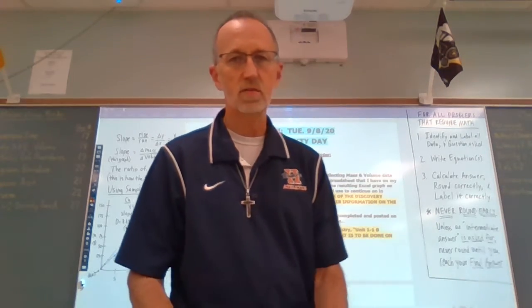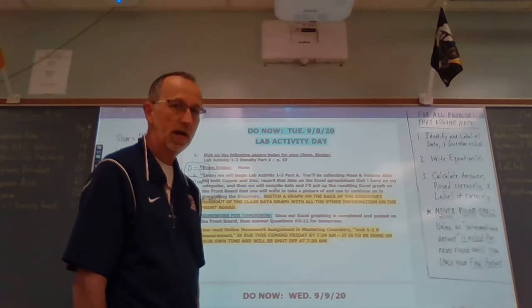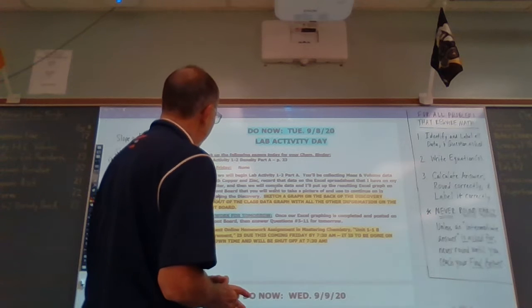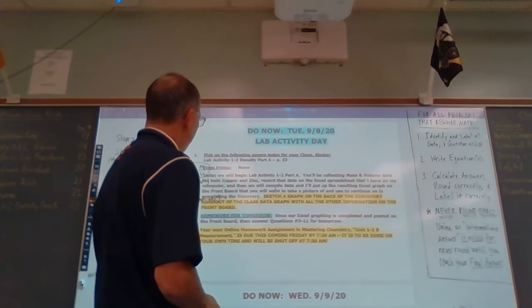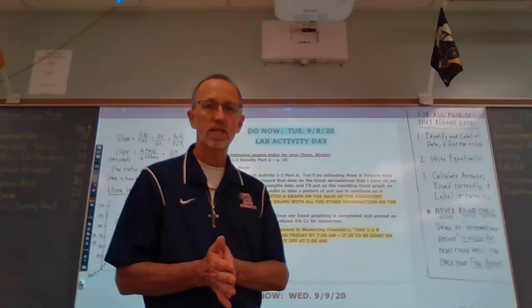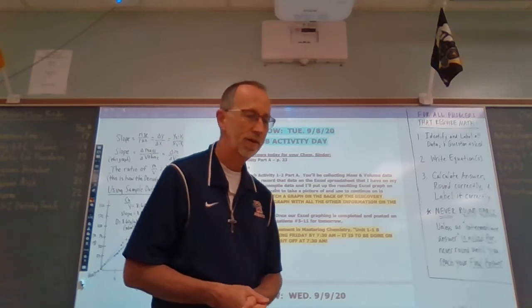So let's look at today's do nows, our schedule for today. Today we're going to start, at least collect the data for and get rolling on lab activity 1-2, part A, which involves mass, volume, and density. Friday, of course, we had our exam, and you took it from home during our e-learning day. Hopefully that went well for you.